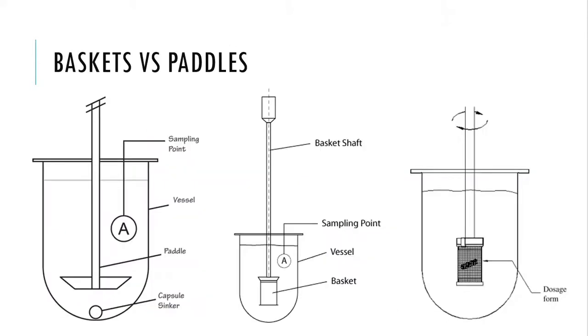All right? Okay, so I told you there are two major differences between the dissolution systems, and here they are. The image over to the left you're going to see is the paddle version. So we typically like to use paddles. It seems like we use paddles all the time. But our pill goes down, and our paddle gets lowered, and our paddle begins to spin and stir that solution up, and it will help distribute that pill evenly throughout the vessel. That's the purpose of using the paddle. And the RPM. As you can imagine, if I do this really slow, well, it's not going to be mixing up properly. If I do this too fast, then it's going to spin it out completely and the whole thing's going to be broken down within 5 minutes. And that's not what we want either. That's why these things have to be controlled.